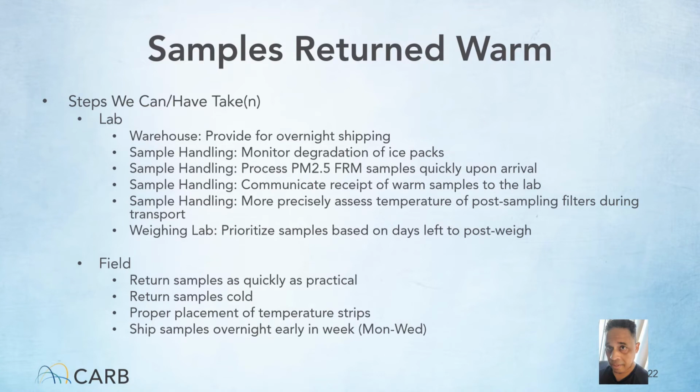There are a few different parties in play here, and all of us can play a role in minimizing shipping samples warm. Most of these are long-standing practices, but looking them over here can serve as a nice reminder of what we all can do now that we see the dramatic consequences if samples are transported warm. I like to highlight a few items.